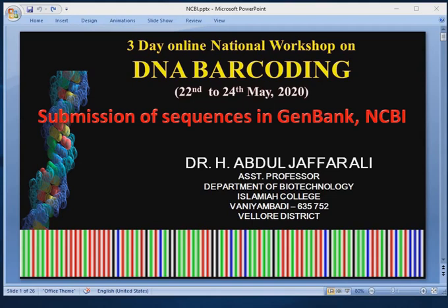I welcome you all for this session on the third day of the online national workshop on DNA barcoding. In this session, we are going to learn about the various steps to be followed to submit quality sequences in GenBank, NCBI, the National Center for Biotechnology Information.